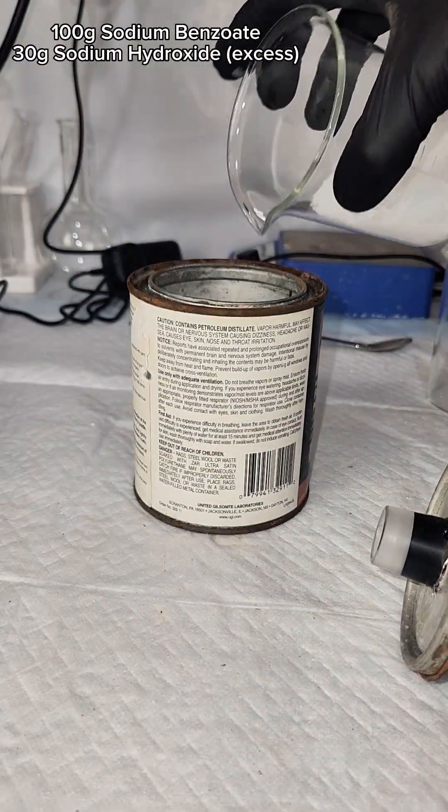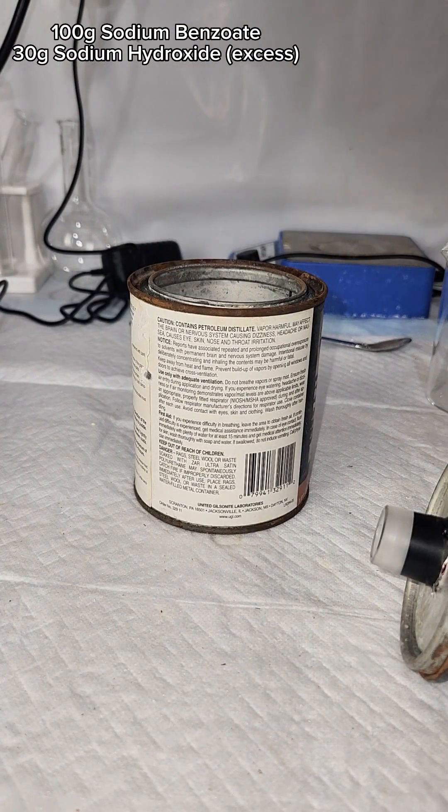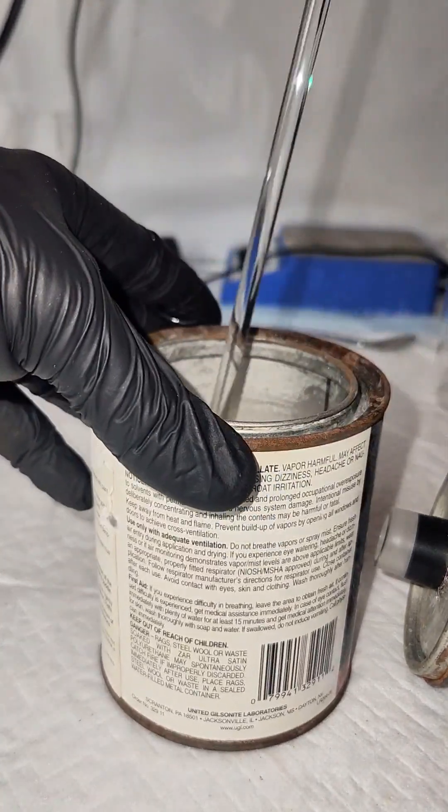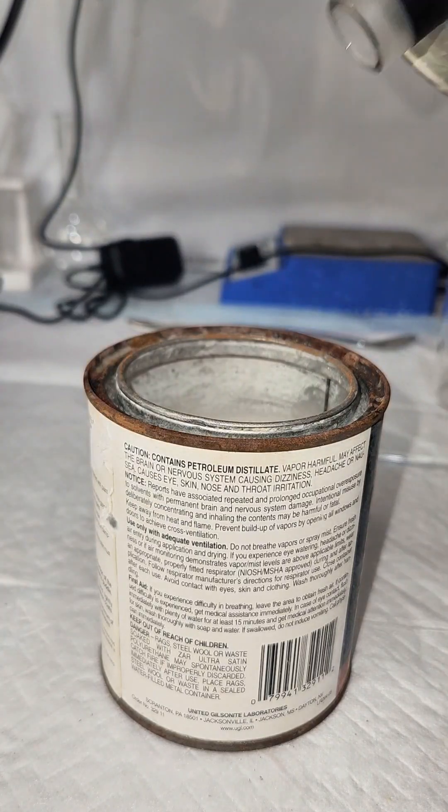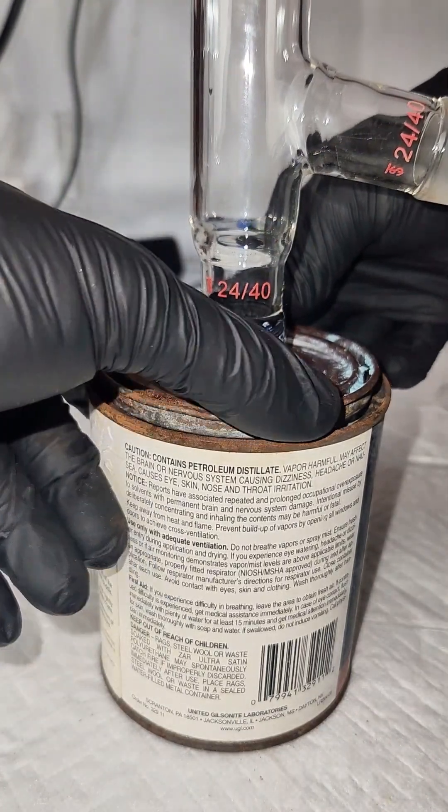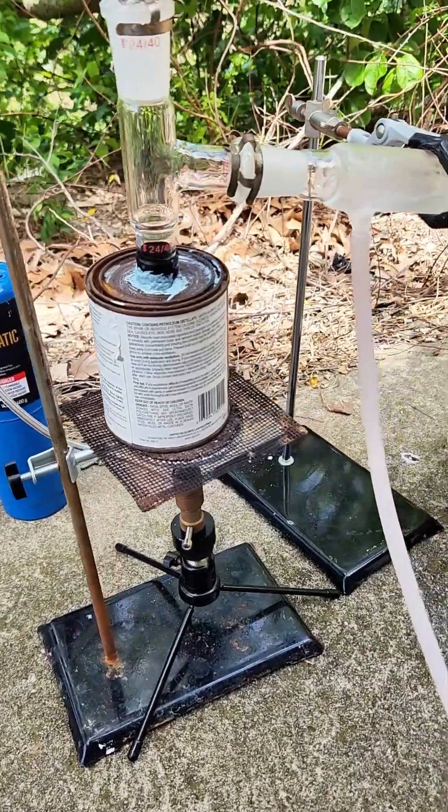To get started, I mixed together 100 grams of sodium benzoate and 30 grams of sodium hydroxide in an old steel paint can. The paint can is going to act as my reaction vessel, and I'm using it because this process would completely destroy my expensive glassware.